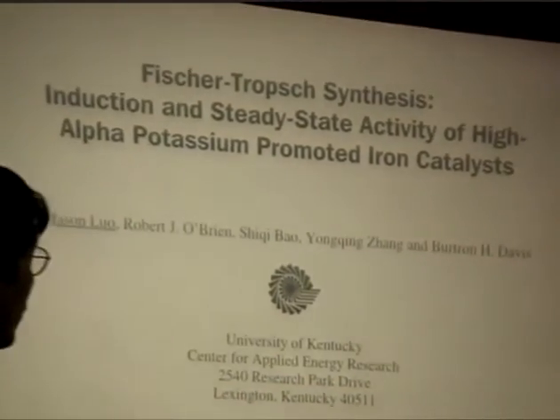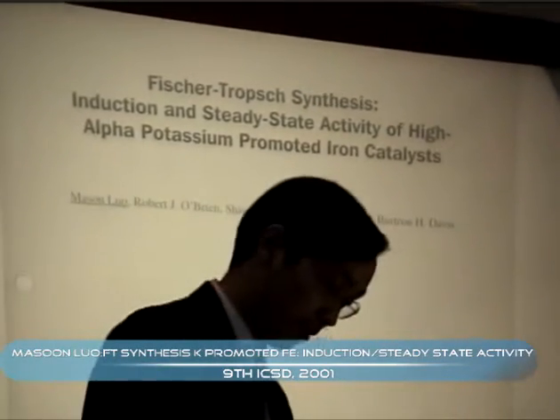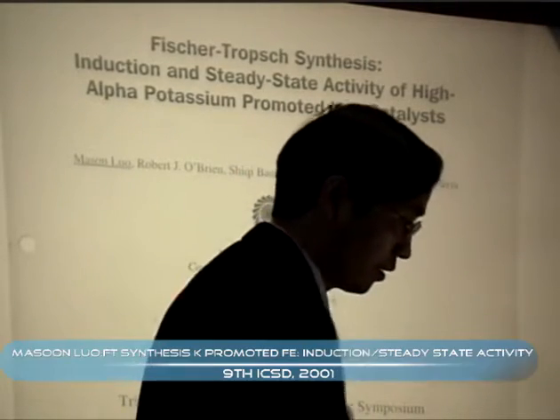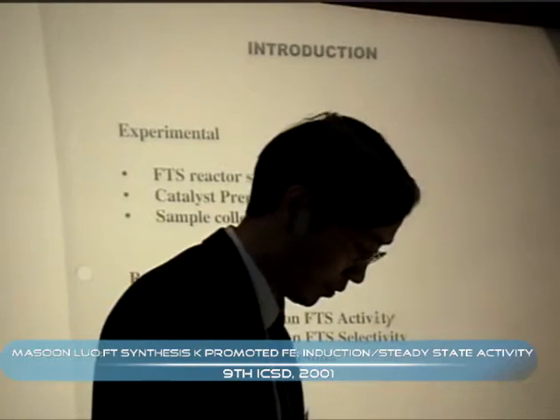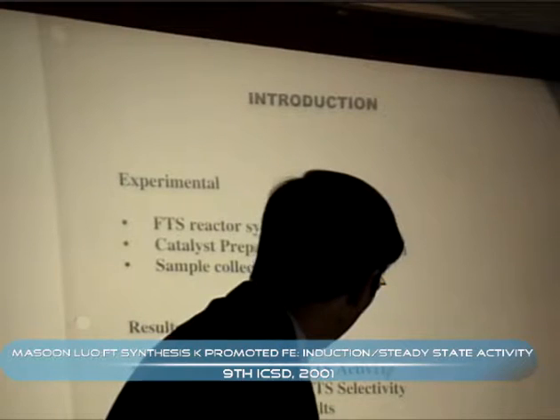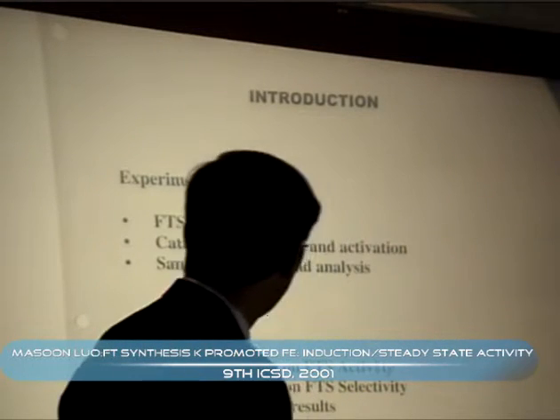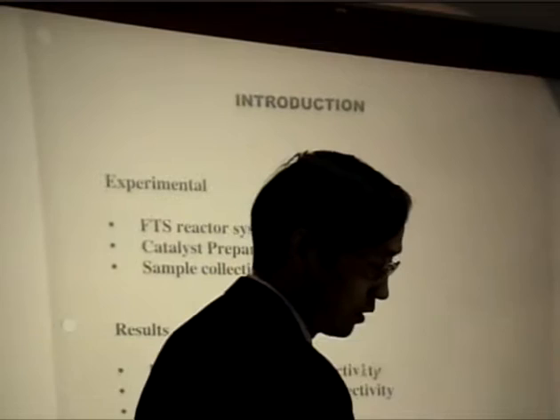High-alpha Fischer-Tropsch synthesis over the potassium promoted catalyst. Before I show you the results of this work, I'll give a brief description of the reaction systems and the catalyst preparation.